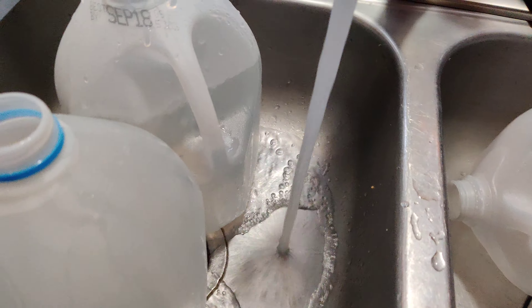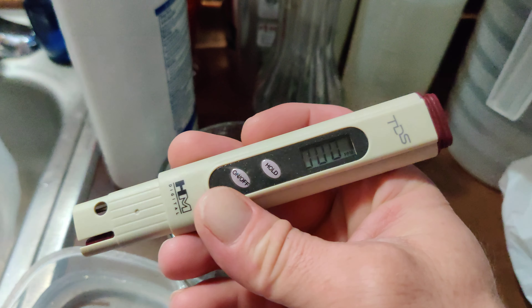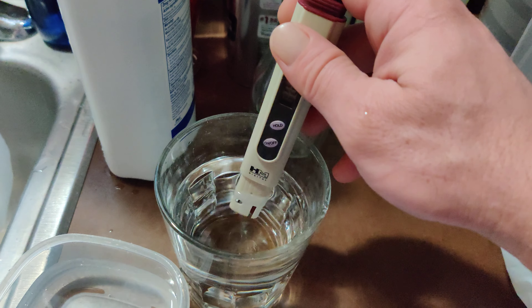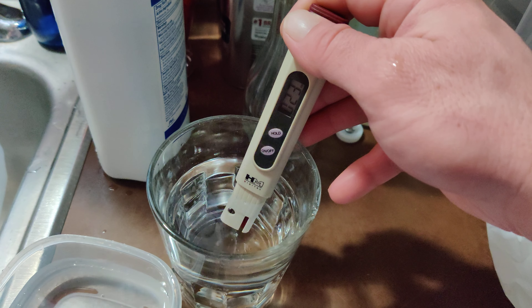Let's see here. Here's the water tester we got here. We're going to give the water a little test. I better shut that off — turn that off. Open it up, turn it on.